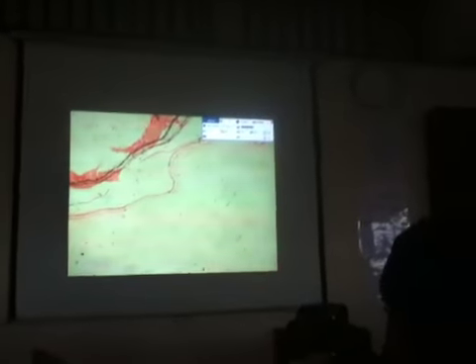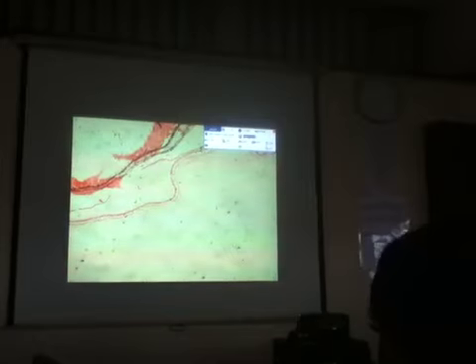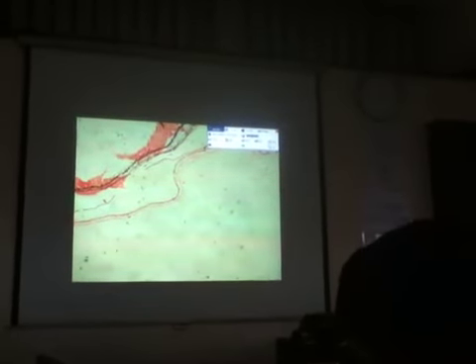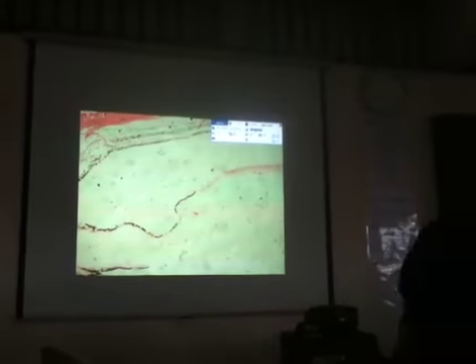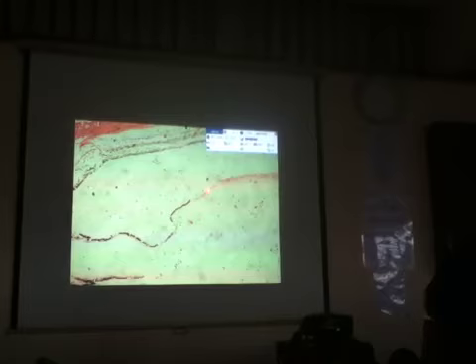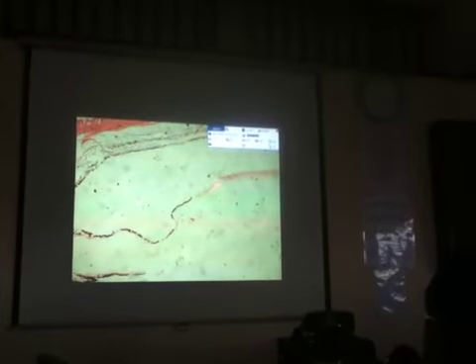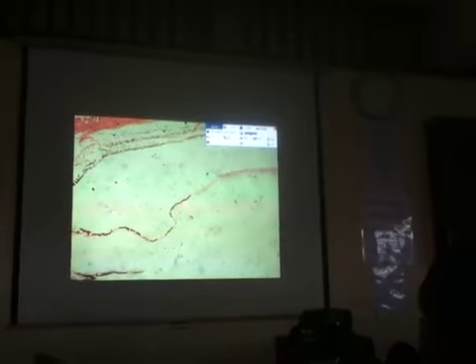Okay, do not be confused when you are studying this slide later: the uvea is usually detached, or sometimes the retina is detached from the uvea. Actually, they should be adherent with each other. Now, there is a portion of the retina wherein the photoreceptor cells, the bipolar neurons and the ganglion cells will not be present.